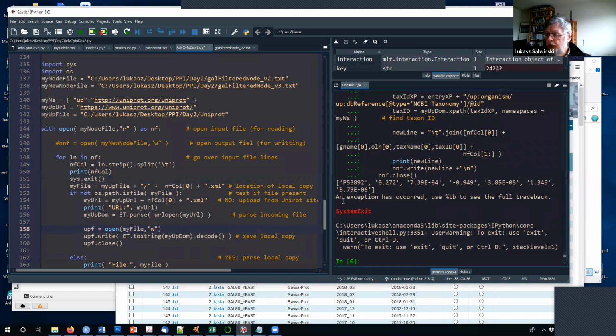But just before, we do have a printout of the NF call, and this is indeed a list because what we see is surrounded by square brackets, and then we've got several fields. The first one is our identifier, and then there are the values for the expression data.